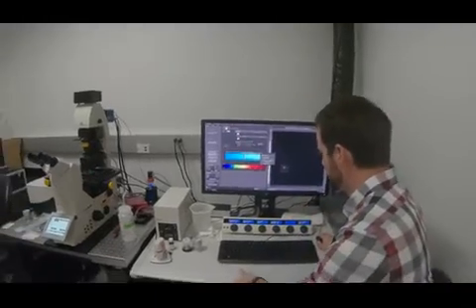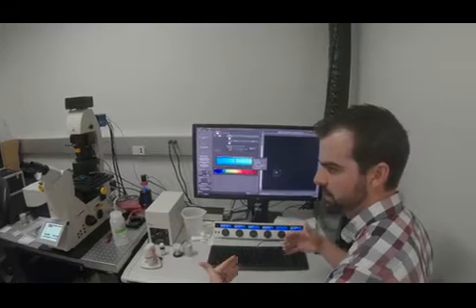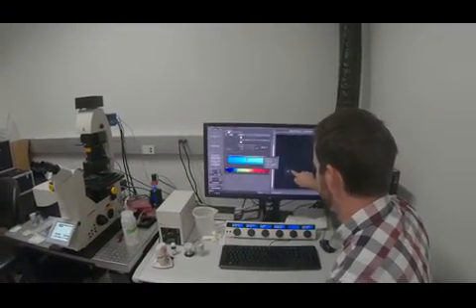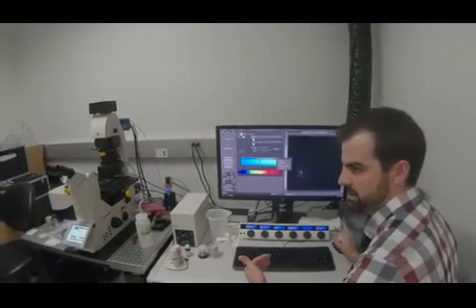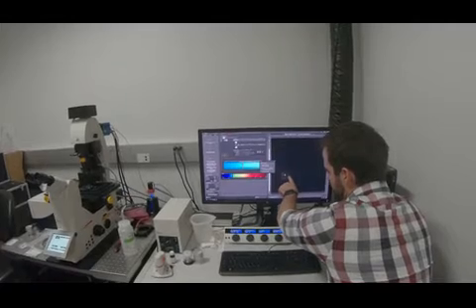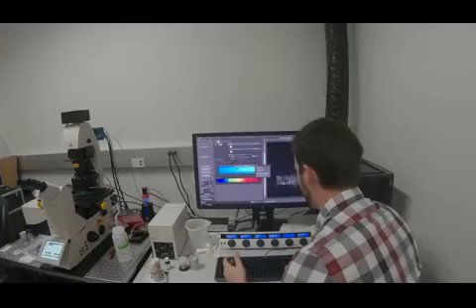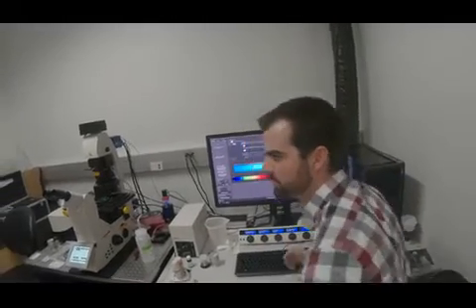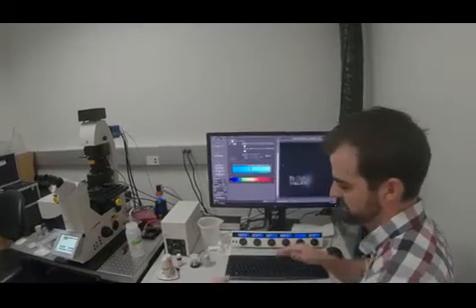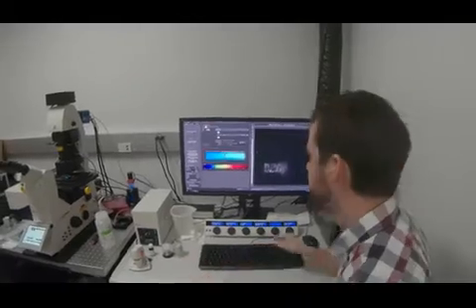So you take one mirror and you try to find the best focus, and then you find something in the middle of the field of view, and you try to make sure that the other mirror matches it. The image is similar. So these dots here, they look focused, and then in the right mirror, they look similar. They haven't moved. They're not darker, or they look brighter because it's brighter on the side, but it's the same focal plane. So now I'm convinced that our two mirror settings, the light sheets, are at the same focal plane, and they're pointing at each other.